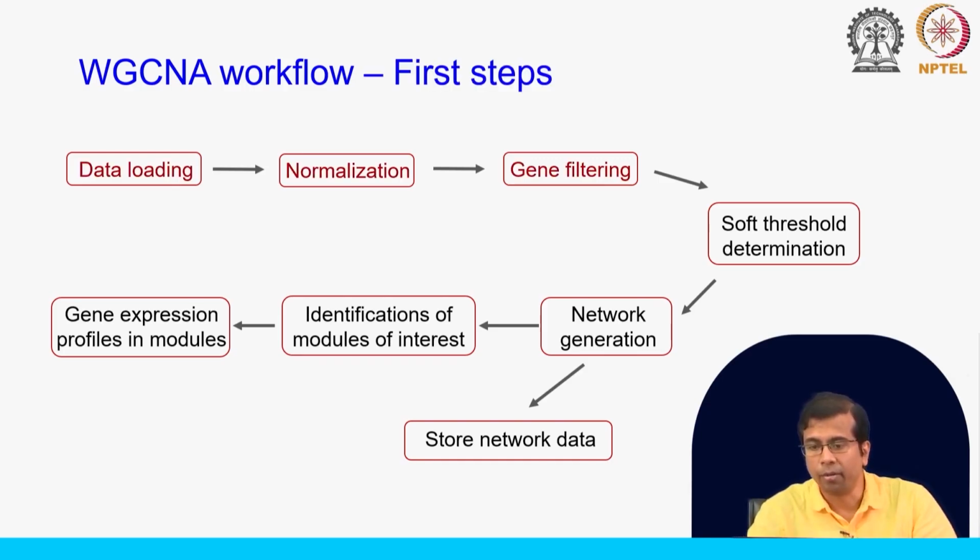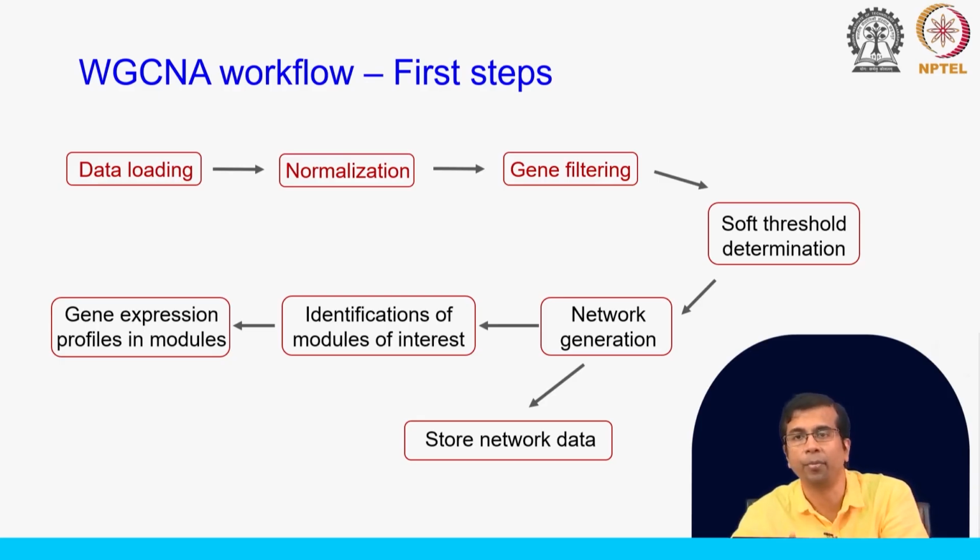Okay. So, in this class, we will complete these 3 steps. First, we will do the data loading, which we have completed. I will simply load the data, apply the drop NA function, and then we will describe normalization. We will do the normalization and see the normalized data, then we will do the gene filtering, and after that we will have some visualization. At each step, we will see how the data is changing when we apply certain functions or operations, and of course, we want to visually see how the data looks after, for example, normalization and gene filtering.